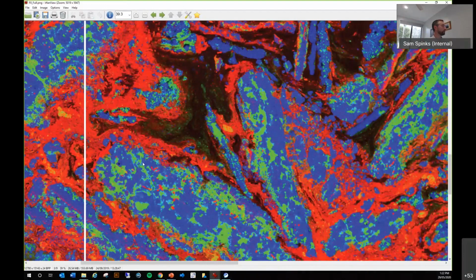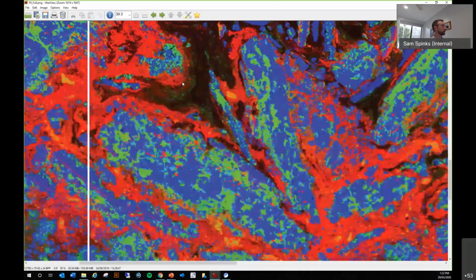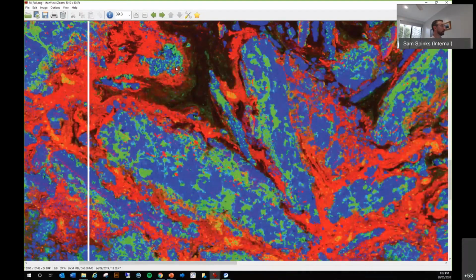So this could be interpreted as pyrite precipitating after, but when we look at this more closely on a micro scale, we can see that actually the pyrite has come before and the sphalerite has grown around it.